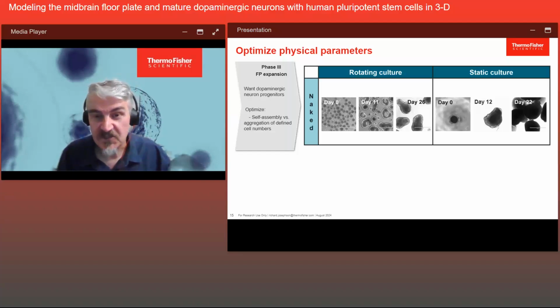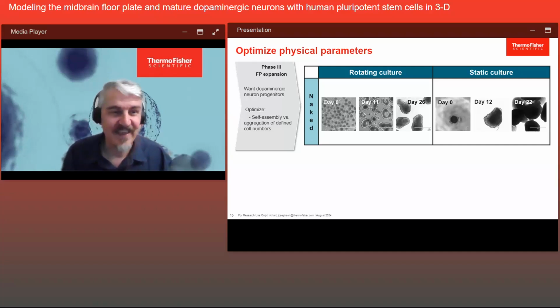The specification media for 5 days leads to strong epithelial outgrowth, followed by a general size increase. And what we get by about 3 weeks is very irregular organoids. You can see these sort of pear-shaped structures in the photo labeled day 26, with a lot of, again, that translucent edge around them showing epithelia.